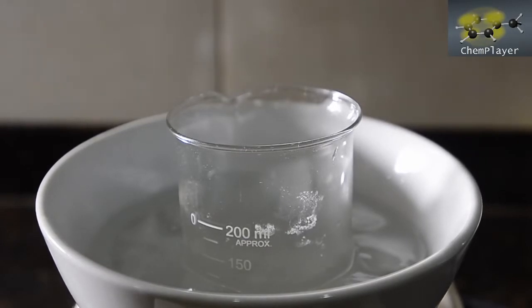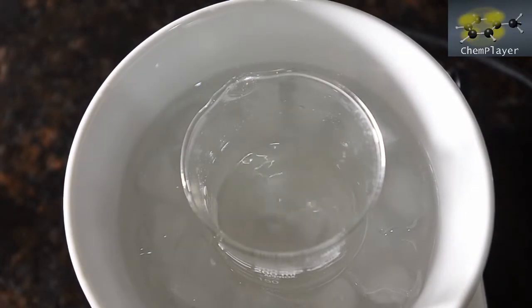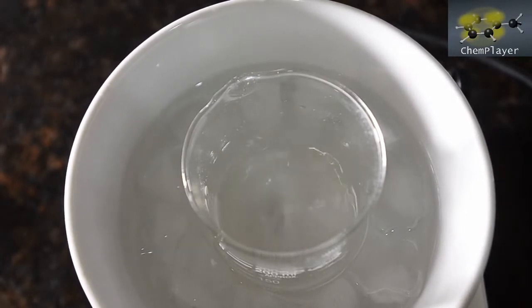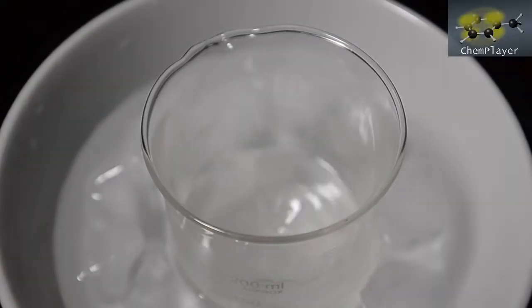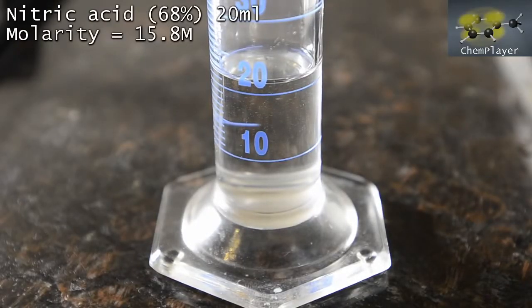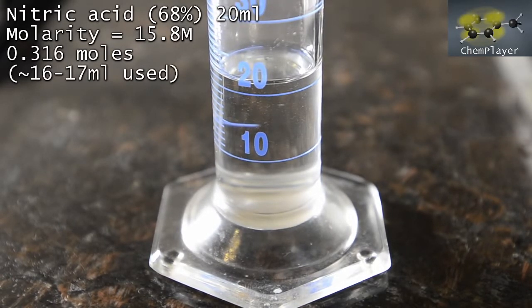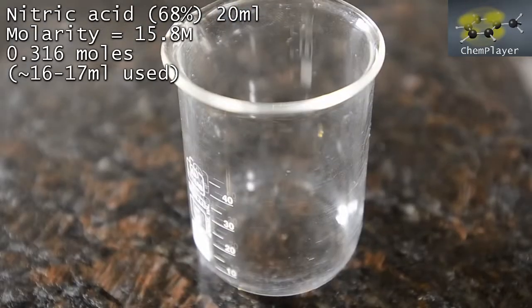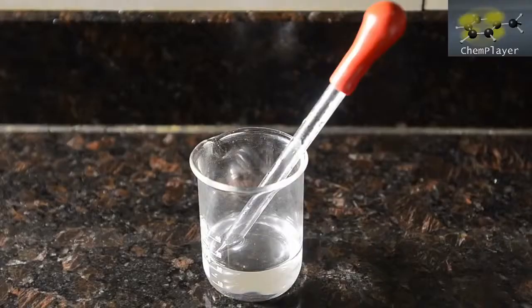The nitration will be exothermic, and although DCM boils at 40 degrees C, we don't want this boiling everywhere. This is happily chilled down now, so let's prepare our nitrating agent. Here we've measured out 20 ml of 68% concentrated nitric acid. In theory about 16 ml of this represents a 1:1 molar ratio to the vanillin, but we'll see how much we need to use as we go along. Let's get this into a beaker so we can add it dropwise to the reaction mixture.